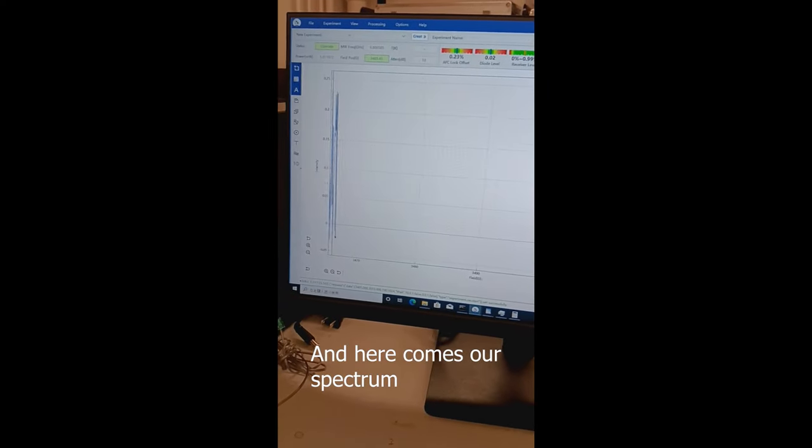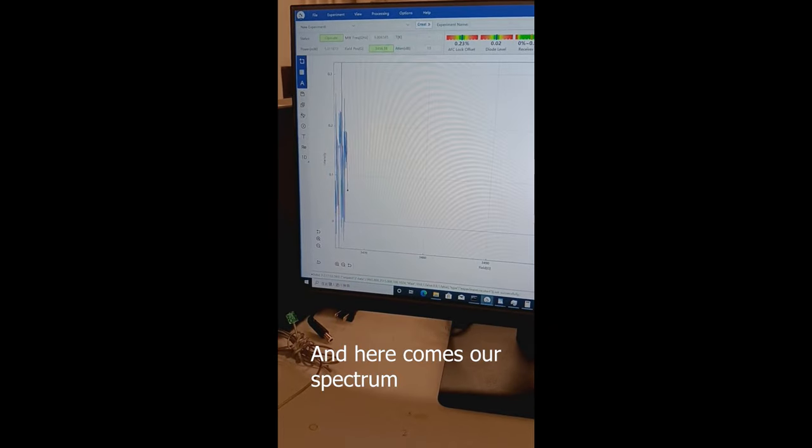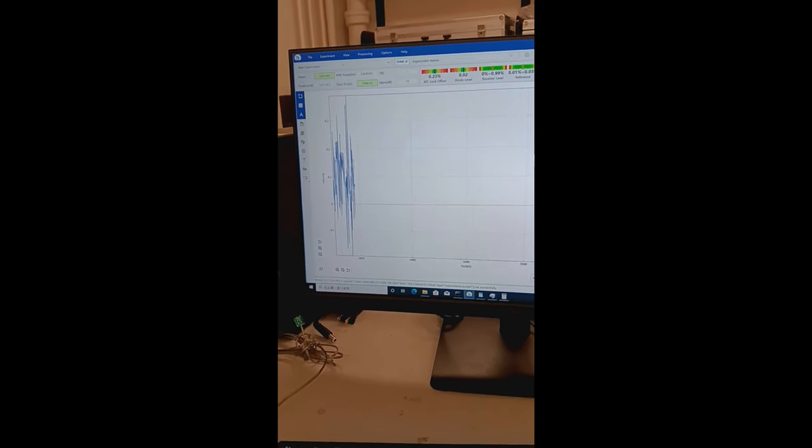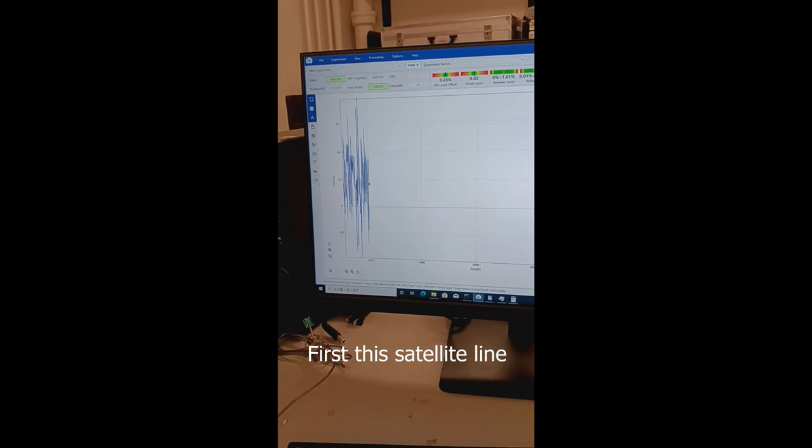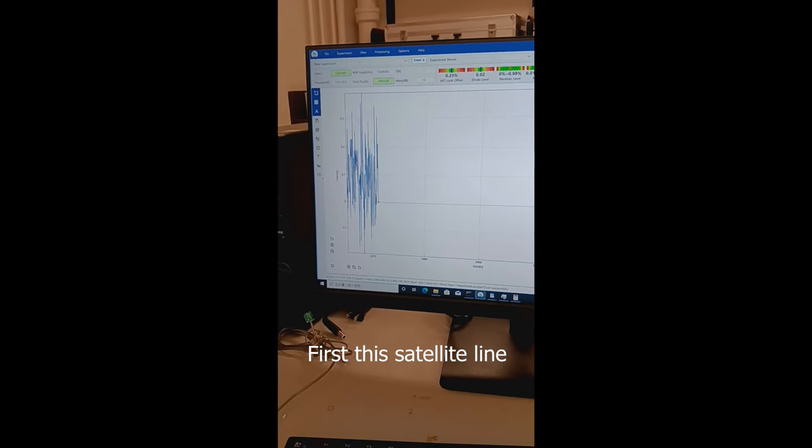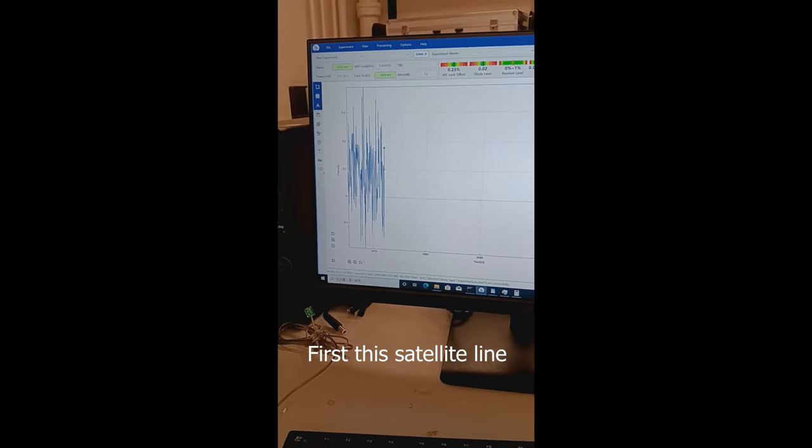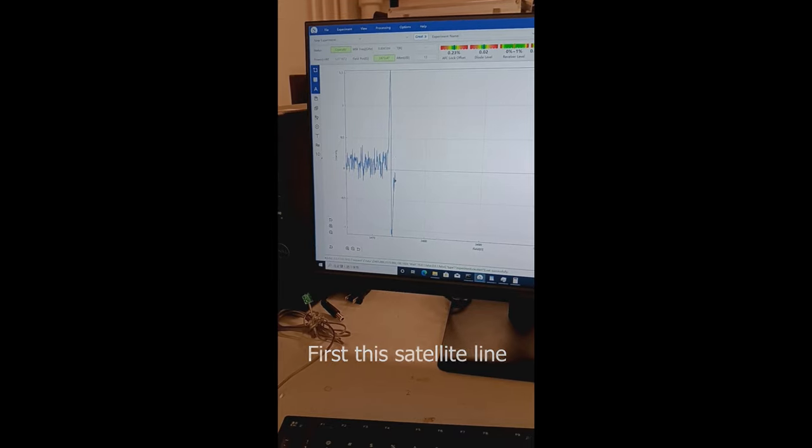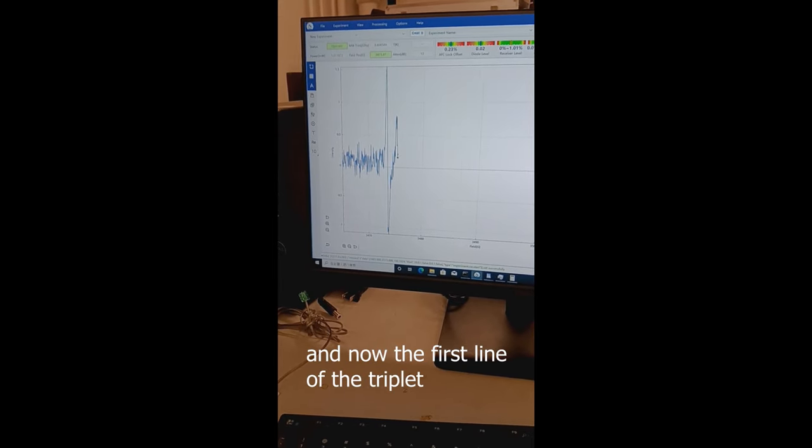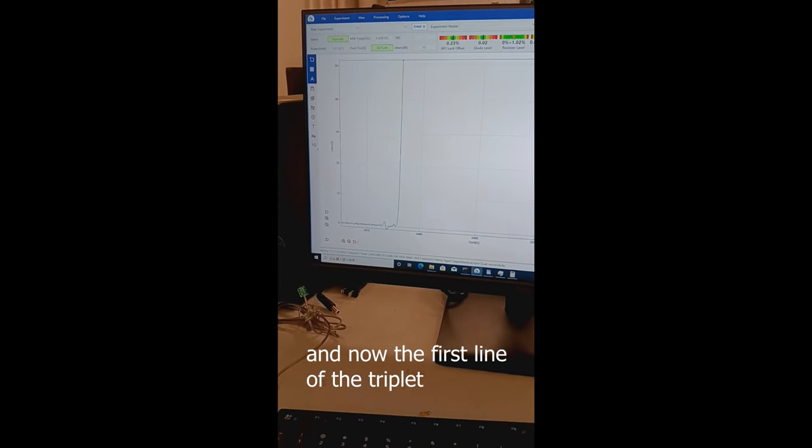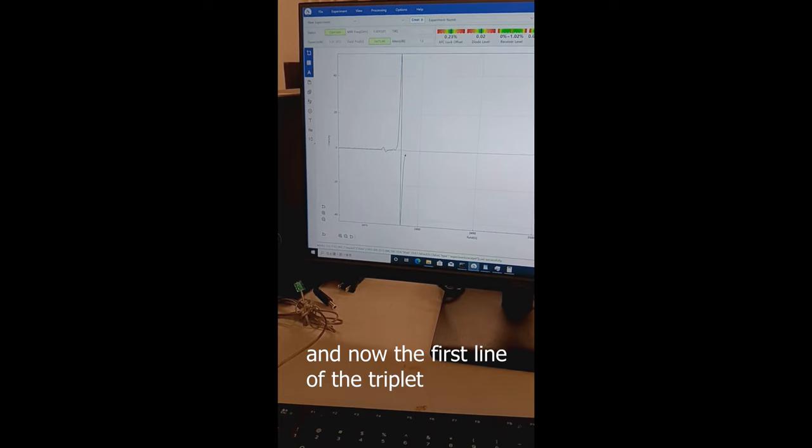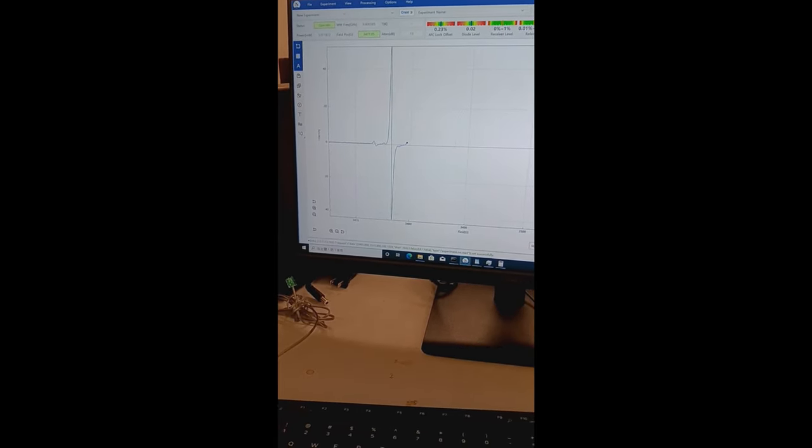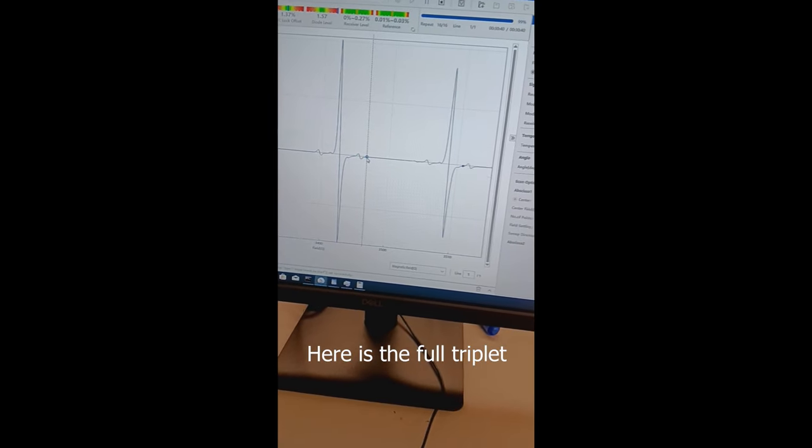And here comes our spectrum. First the satellite line. And now the first line of the triplet. Here is the full triplet.